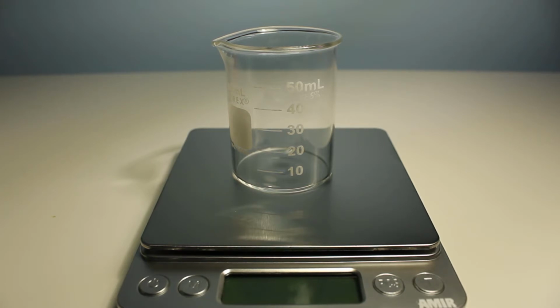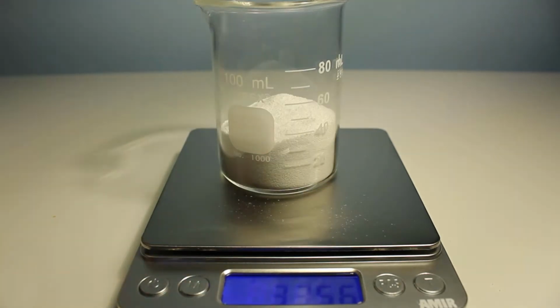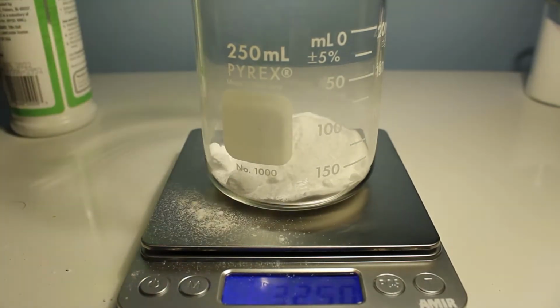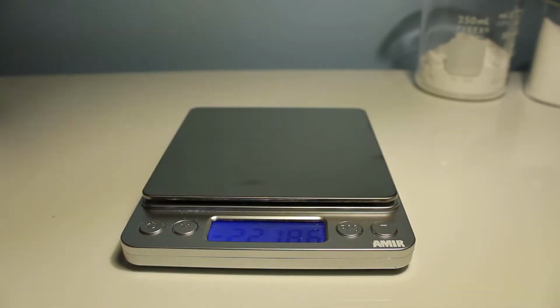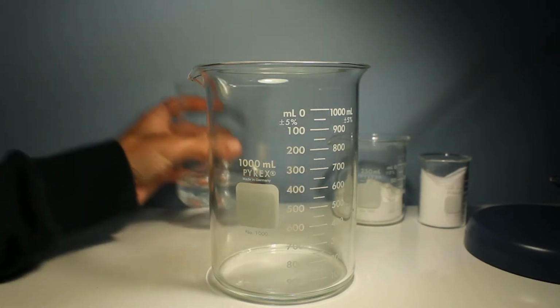In my case, my citric acid is 98% pure, so I'm going to have to add a specific amount in order to give it the right weight it needs. Now that all the ingredients are together, begin mixing. First, add the solvent into the beaker.